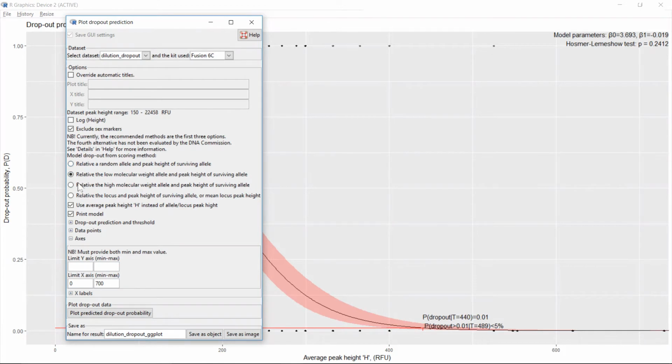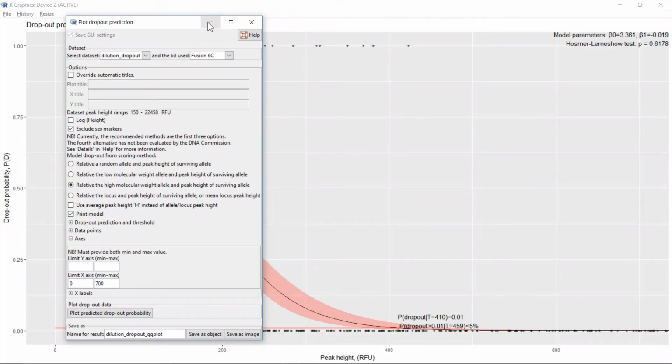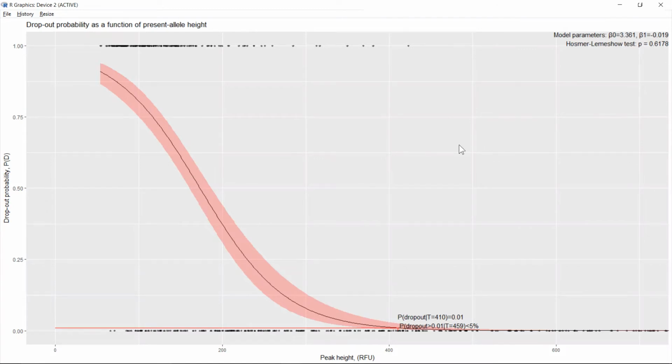So we can repeat this with all the methods that we are interested in and collect the important information in a table. And what I would collect is the test statistic, the point estimate and the conservative estimate, and perhaps the model parameters as well.